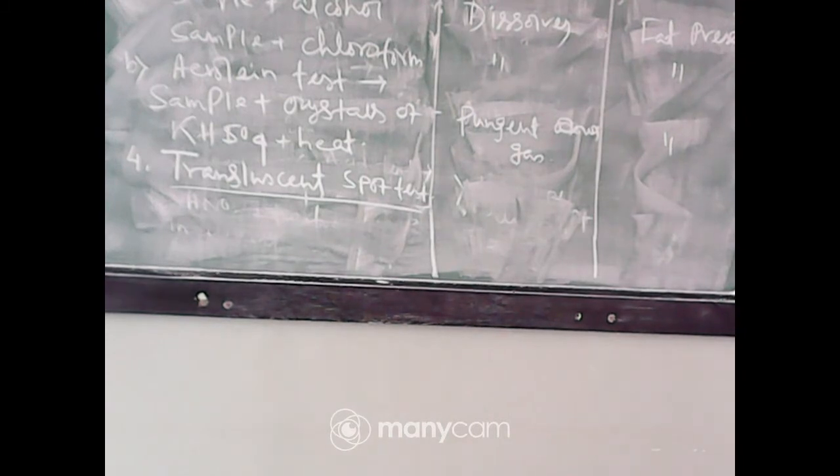The previous was the acrolein test. Next is the translucent spot test.